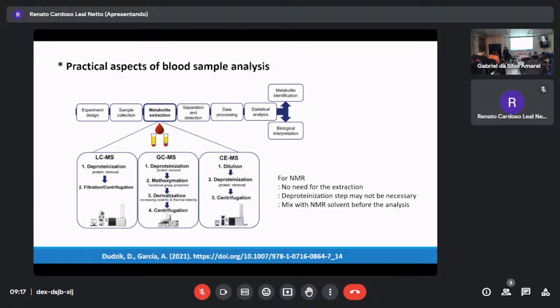Shimming means you need a certain amount of deuterium solvent to lock the peak shape. So that's why the official protocol is, if you take out the urine, you dilute it with 30% or 40%, sometimes 50%, D2O. Then D2O is there, you measure. You don't have to freeze-dry or measure directly. This is an issue, but blood samples are the same.